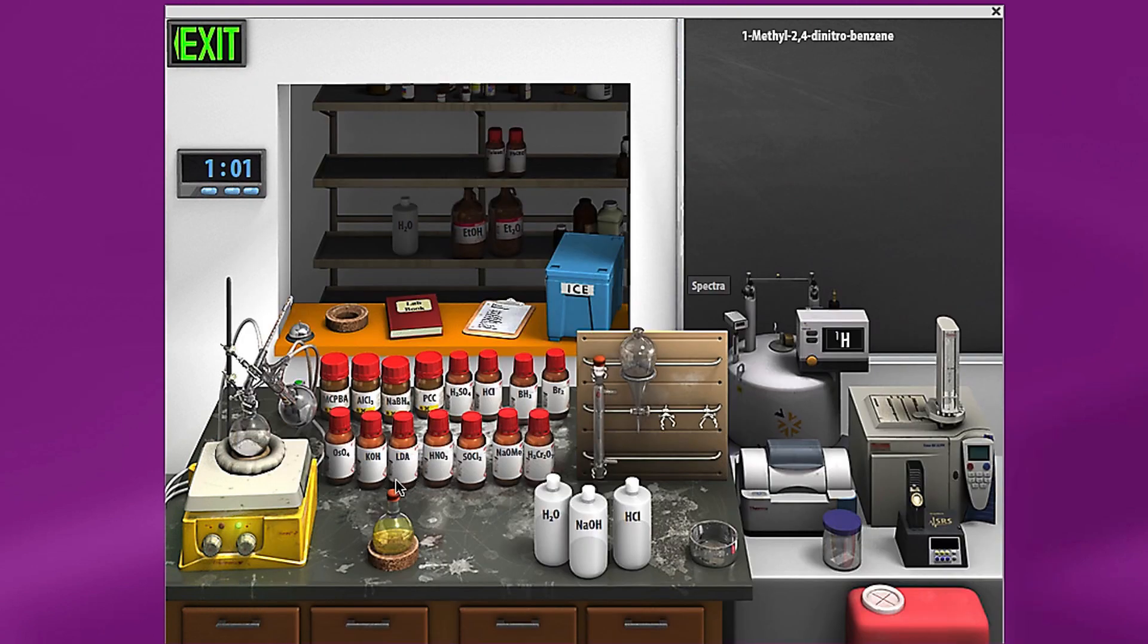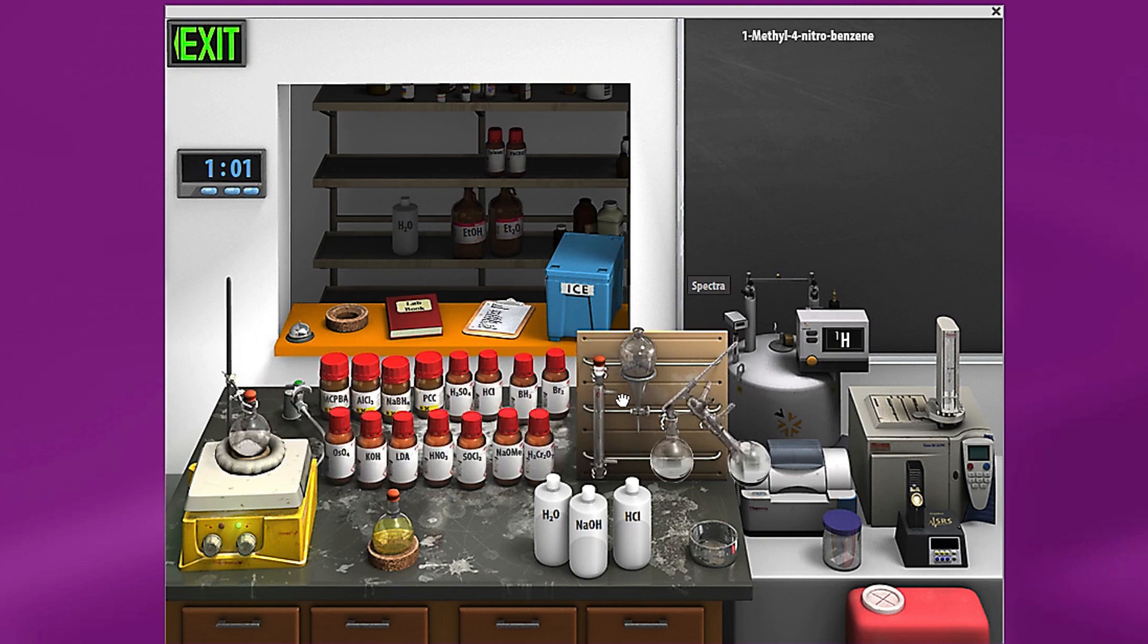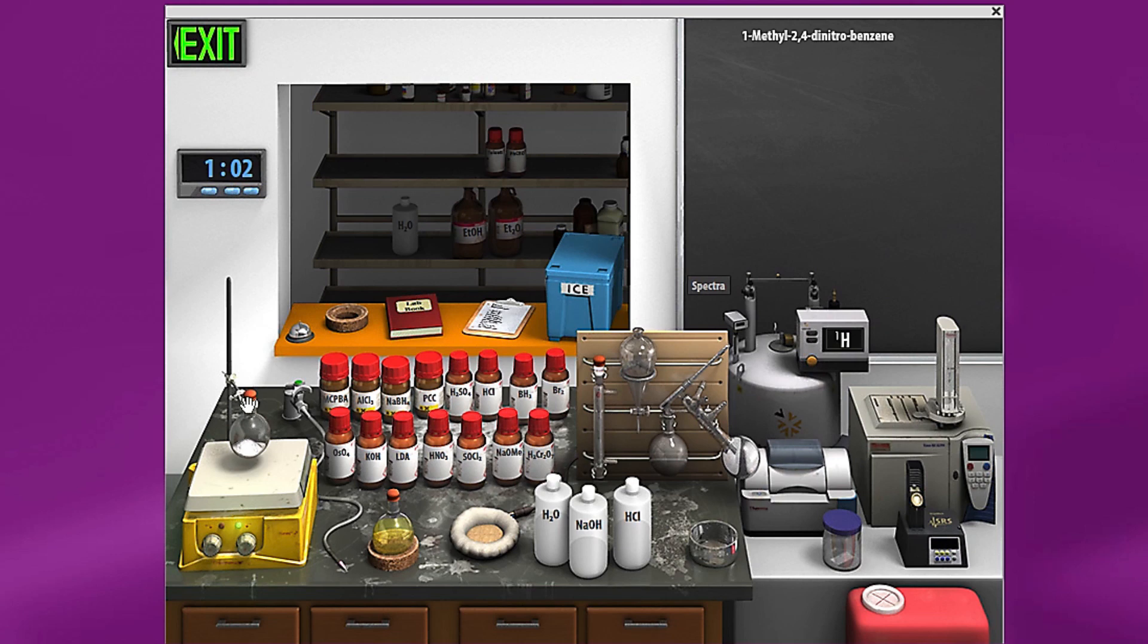You can also grab what remains in your distillation flask. You can see as you, the first thing you do when you click on it is it's actually going to select the distillation apparatus. Let me go ahead and put that back. And then now we have our collection flask that contains the combined product and we have our other flask with the collection flask where we pulled off what was left and remaining. And so there you go. That's how you do a distillation.